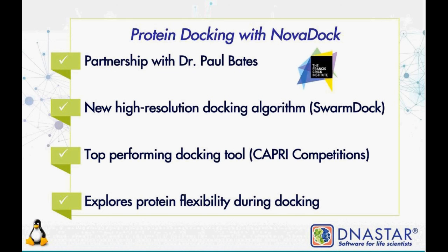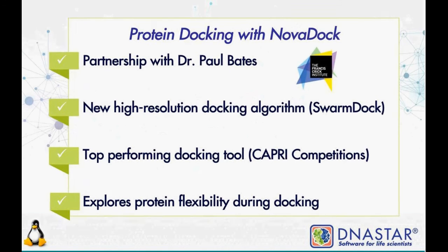It's been a top-ranking tool in the CAPRI competitions, as with I-TASSER in the CASP, and it really explores the flexibility of each protein during docking. As with NovaFold Antibody, this is a locally available application only on Linux Workstation, but we're working to get it on the cloud as well.